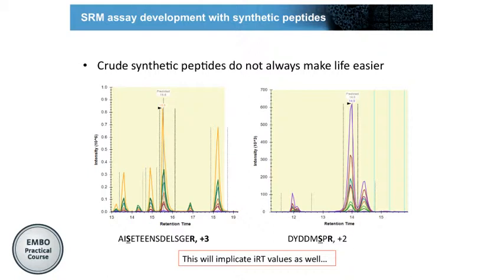For what reason? You're saying nearly isobaric peptide, so it's... Yeah, because I would take it as having a very, very similar mass. What type of modifications do you know that are very, very small? The C13 and C12. If we do not have 100% C13 or nitrogen 15, you can have a mix.